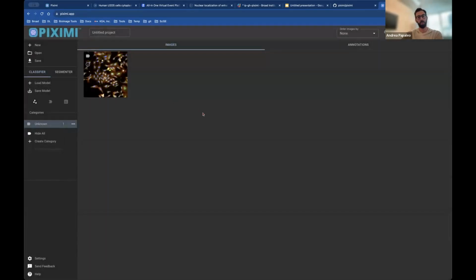But other than that, it also works on your phone. It'll work on an iPad. You also have touch support for the annotator, so you can use an Apple Pen or any other stylus to create these annotations. So it'll run on low power devices, your computer. You can run it on desktop. So if you want to do your segmentation and classification on the go, you can.